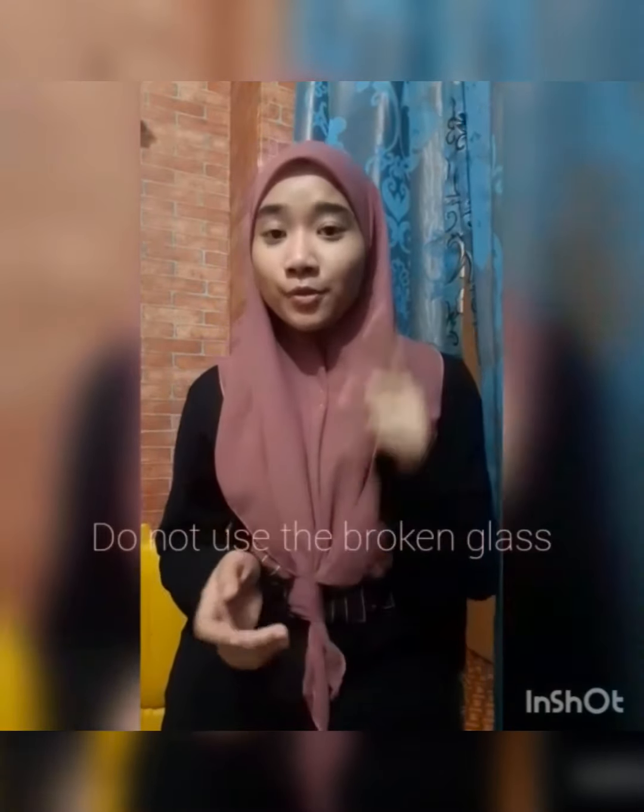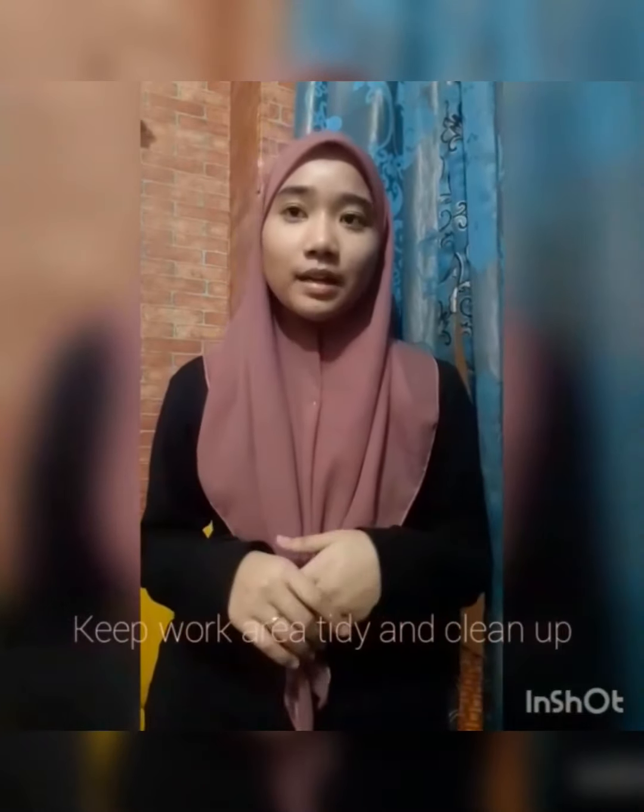Next precaution is do not use a broken glass. Remember this because it will endanger yourself during the experiment, especially when hot material or chemicals are poured into the transparent glass. It will cause the glass to break. Then keep our work area tidy and clean up any spills, including water on the floor.